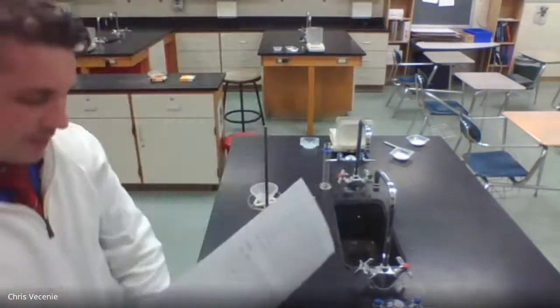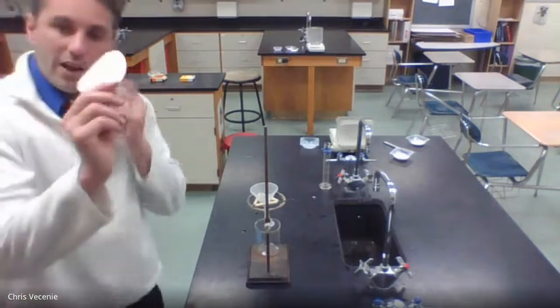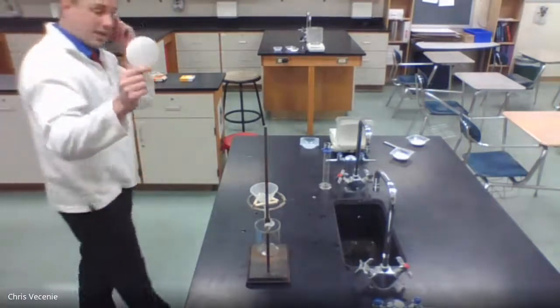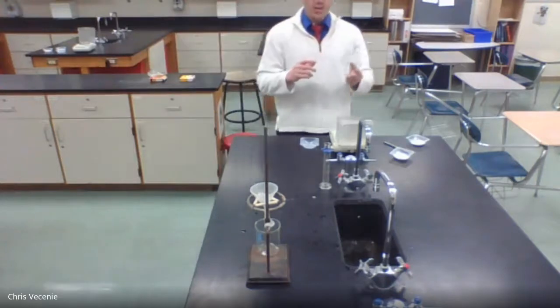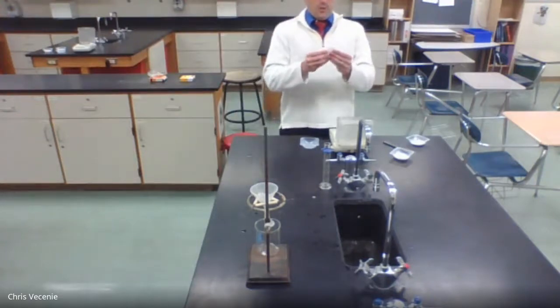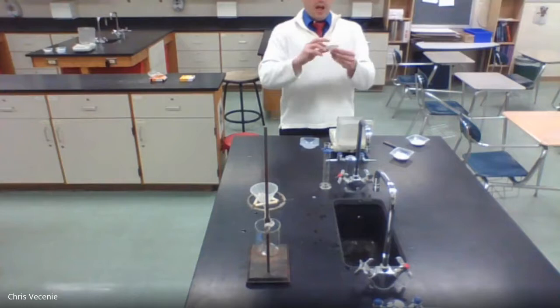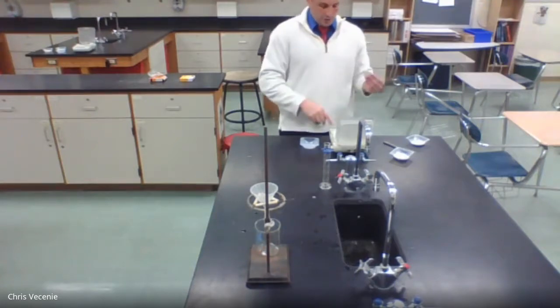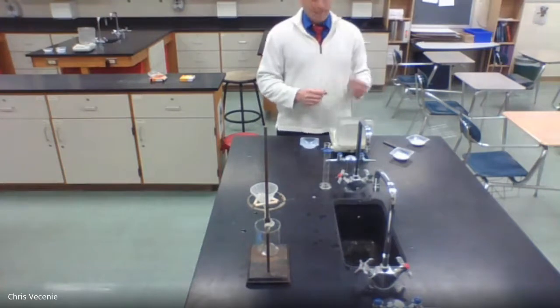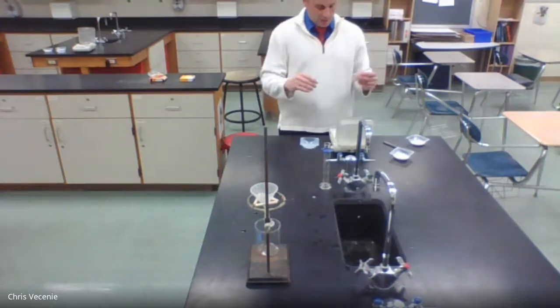All right, and the reason is at the end of the day, I need to know what this guy weighs by itself because when I get my calcium carbonate on it, I'm going to need it. So what I'm going to do is simply fold this in half twice. That's 1, to set up how it's going to be when it filters. And 2, it just fits onto the balance better to make sure none of the paper's hanging off the edge.